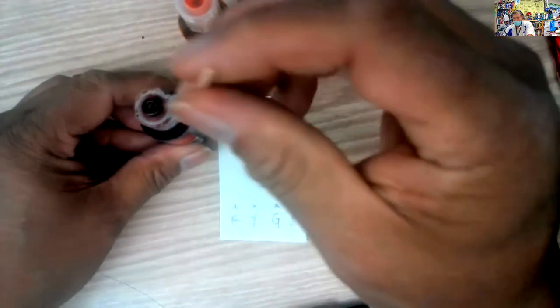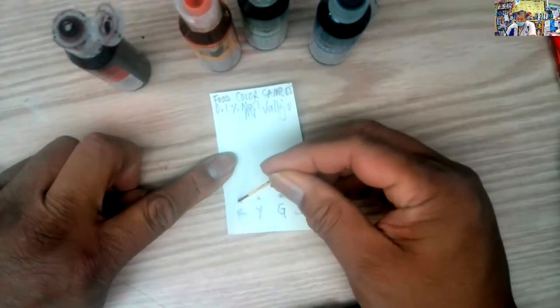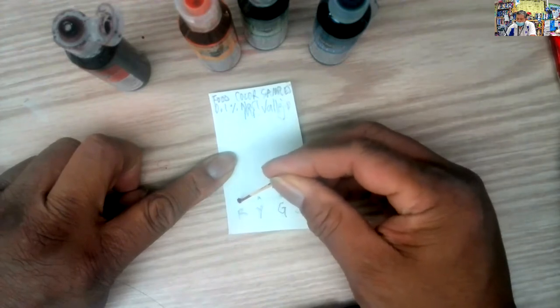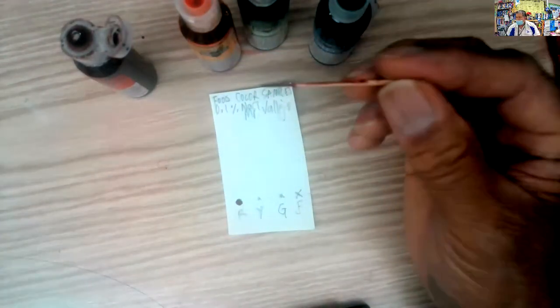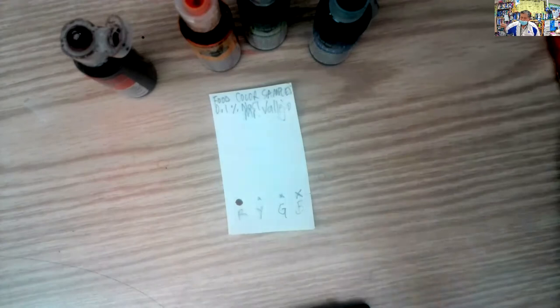But, oh man, there's the red all over the place. Try not to squeeze that when you open it. I got some on my desk. So there's a red. I'm going to put a spot right here, and then you're going to let that dry. Try to keep it fairly small, but don't put too much on there because you want it to dry as well. So I'm going to call that good, and I'm going to get rid of this in my wastebasket to the right off the screen.